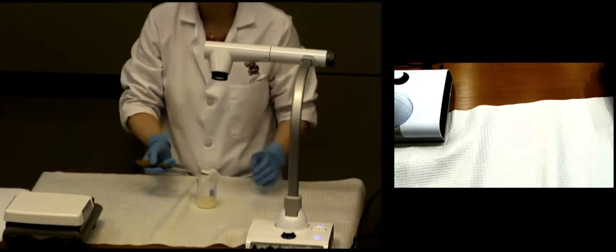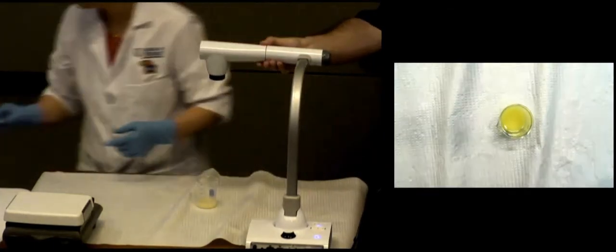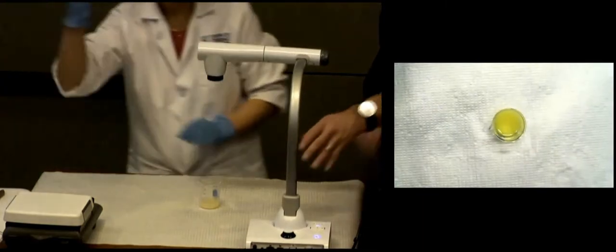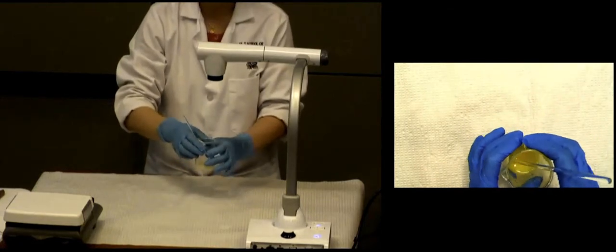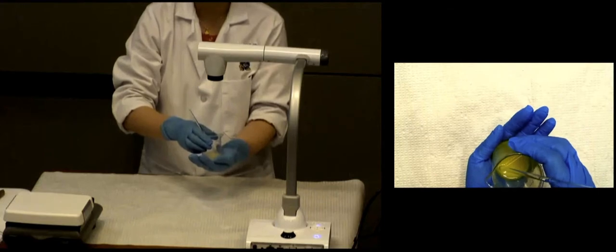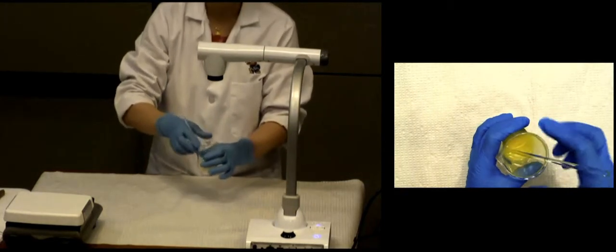Okay, so of course we don't want to have the stir bar in there because it's magnetic, so you can use your spatula to lift it up. At that point, you should be using your glass stir rod, okay? And because we didn't really go to a very high temperature, it's not really burning hot. As long as you feel it's comfortable, it's not going to melt my plastic mold. That means I'm ready to pour, all right?